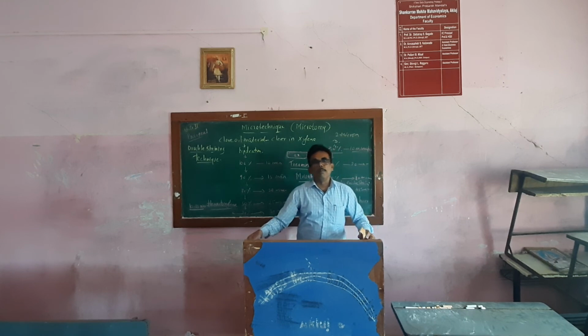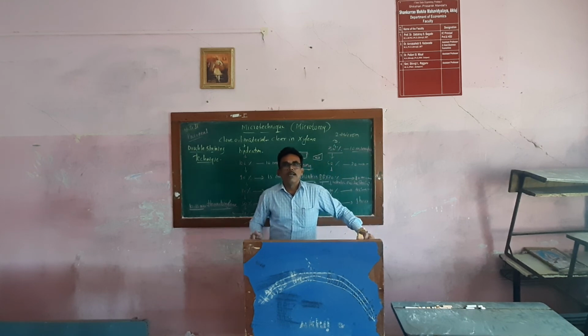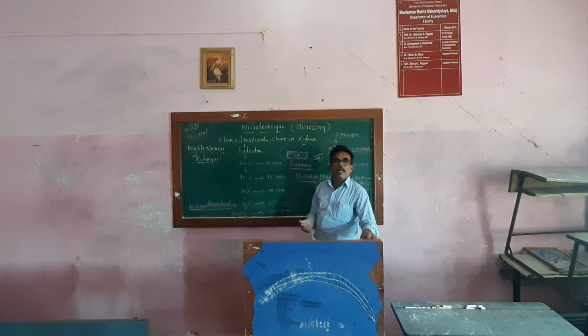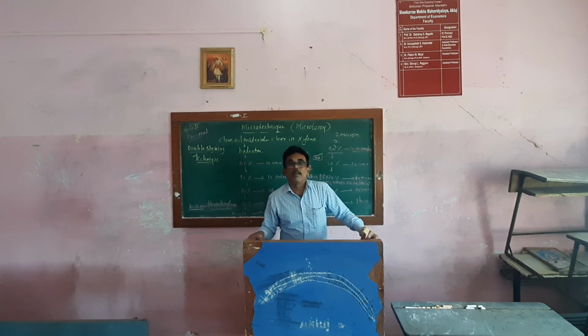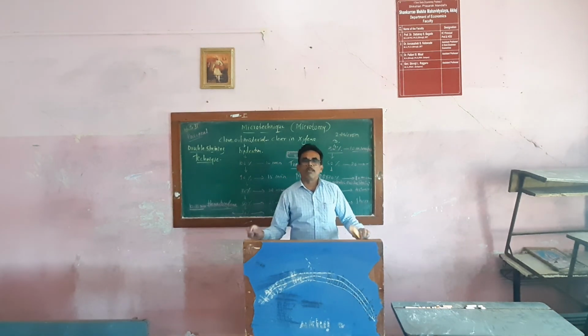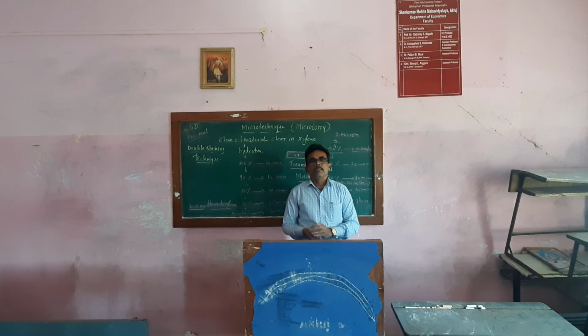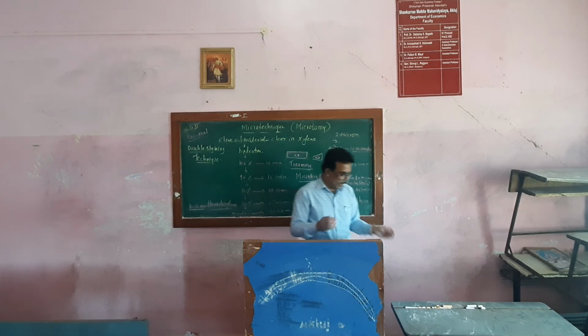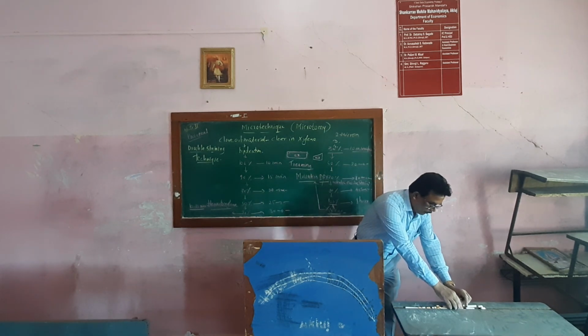Likewise there will be fixation of the sections to the slide, and then the remaining procedure will be carried out, and finally the slide of that particular organ can be observed under the microscope. This is the microtechnique, and you have to write that.